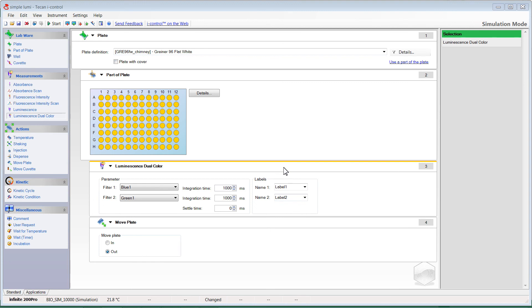For those who would like to do luminescence readings with injectors incorporated into the method, look for another video on this channel or contact TECAN for help on that topic. As you can see on the left side of the screen, there are ways to implement dispensing and injecting steps along with your assay to generate signals based on the injection of different reagents. Thank you for your attention, and please be sure to contact TECAN if you need additional help.